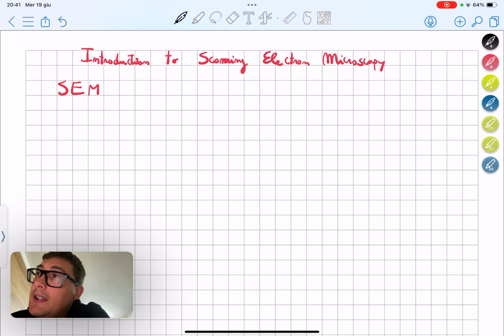which you might have seen already, and they are like a photograph of the sample, in which one can tell, even without any knowledge about the way in which the signal is collected, the interaction, and the mechanism in general, but one is able to grasp some aspects from it because of the simplicity of the topography, especially when related to the contrast.